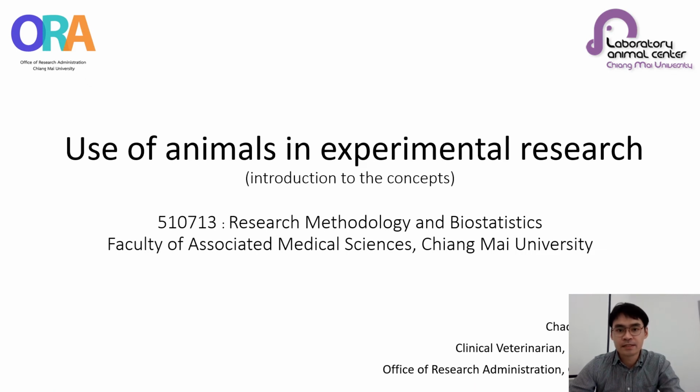Okay, the next topic is use of animals in experimental research. It is the same as the previous topic, because we have a short time, so I am just talking about the principles of the animal care and use guideline. For more information, you should read further in the Guide, 8th edition.